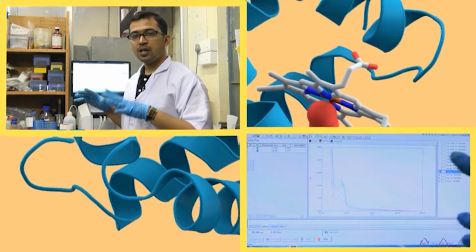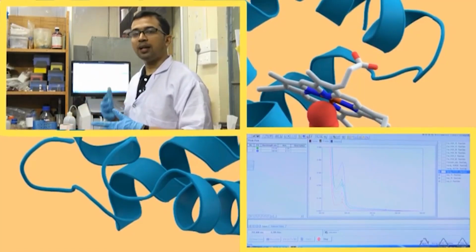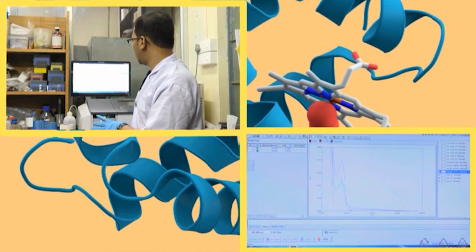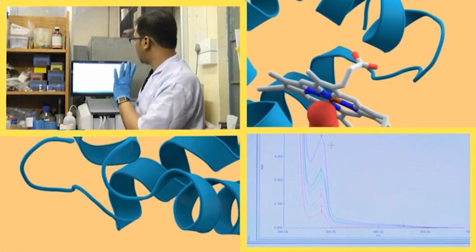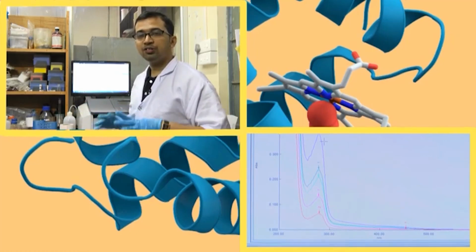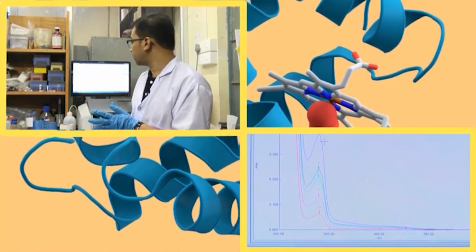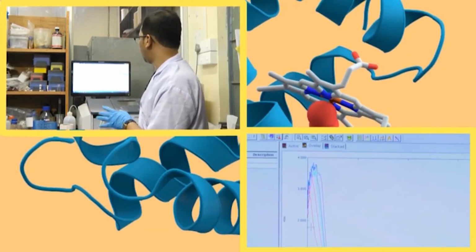But most importantly, we are interested in analyzing the UV spectra of tyrosine or tryptophan here. This protein UV spectrum does not have any remarkable absorbance or peak in the region above 300. Scanning from 600, we do not have anything above 300; it appears in a region of less than 300, around 280 or 278. This is characteristic of a protein spectrum having amino acid residues which have a chromophore. And apart from it, this region, make it to 4.0, is for peptide absorption.